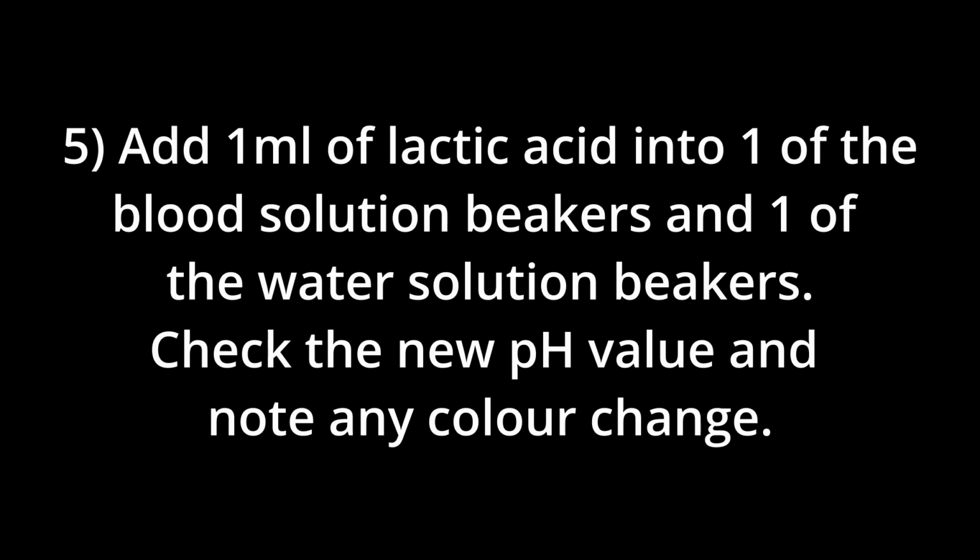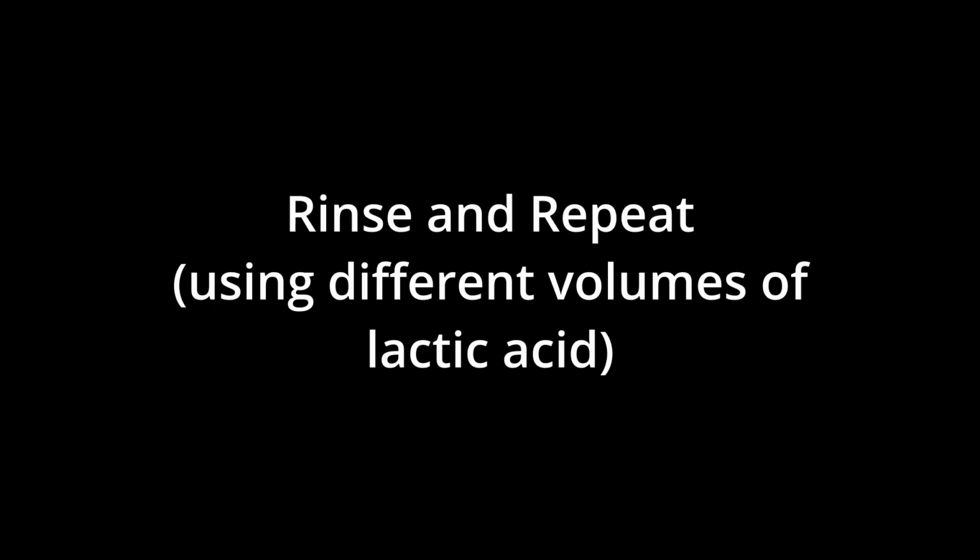You're then going to be adding 1 milliliter of lactic acid into 1 of the 25 milliliters of blood solution and 1 of the 25 milliliters of water solution. Compare the results, so record the new pH of that solution and record the new color. Carry out the same process using different volumes of lactic acid and write down all your results into the table in the lab manual.